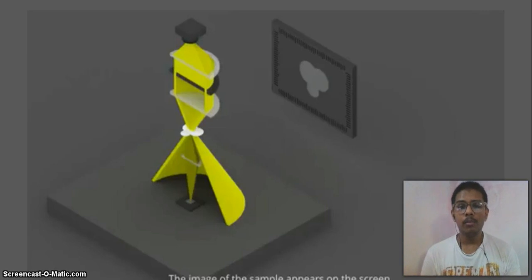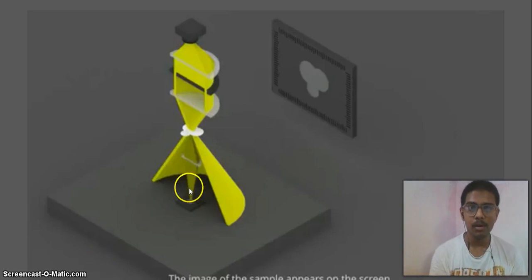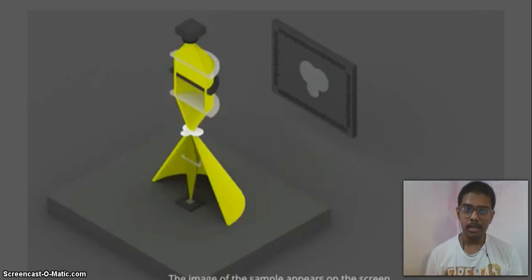So actually what happens, central light doesn't give any spatial information, which is undiffracted light. That is the light from the specimen which goes directly through the specimen in light microscopy. What will happen if we allow the central light? It will go through the condenser lens and fall on the specimen, and coming through the specimen, it will not be diffracted. And whenever any light is not diffracted by the specimen, it will not contain any spatial information as well as temporal information about the specimen.